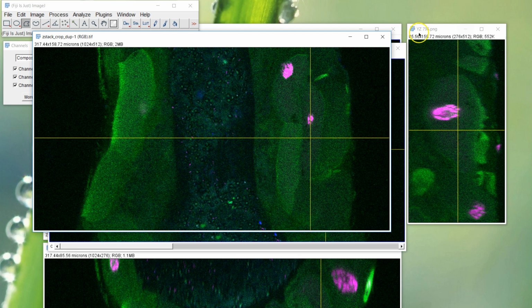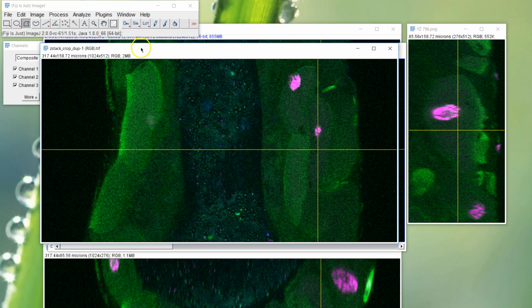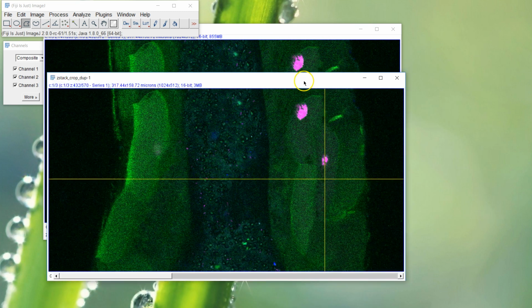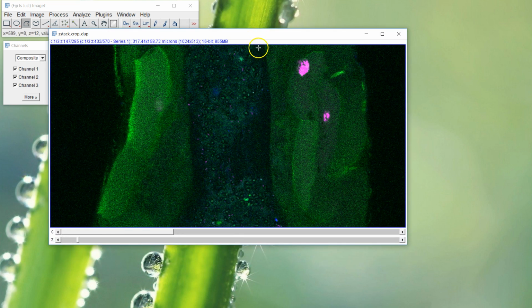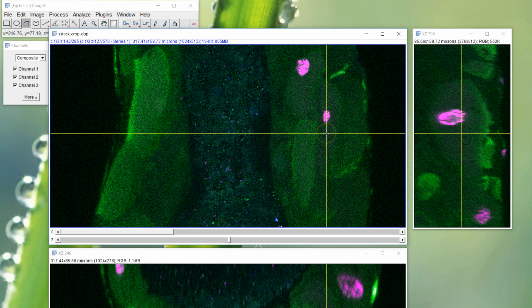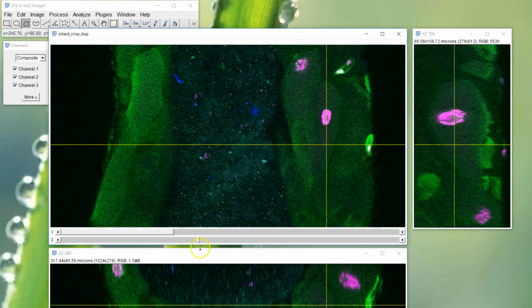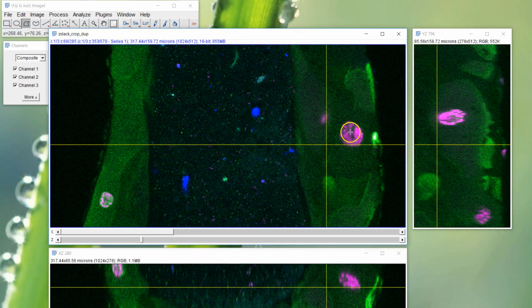So let's try and recreate that in Fiji just to get a slight little part of that. What we can do, so here's my RGB picture TIFF from before. Let's come back to the one I was playing with, and we'll bring on those orthogonal views with Control-Shift-H. And let's say we wanted to pick a particular slice here, and then move it down to the bottom, maybe more up to the top. I'll try to find a structure that might work. There, for example, might be a little bit more interesting.